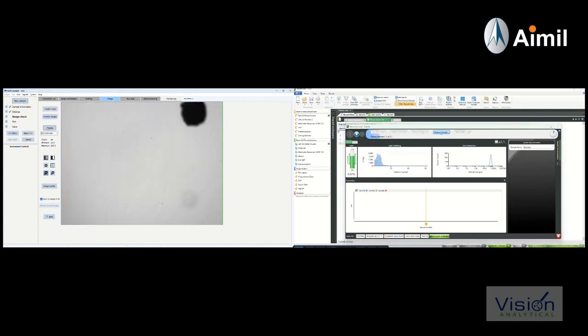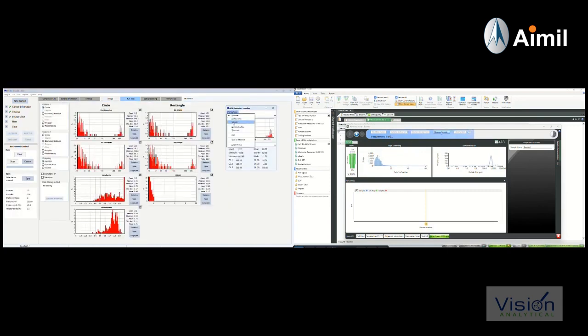And what I've noticed is there are definitely some small particles in there. If I convert this over to a volume weighted distribution, we'll start seeing some similarity between what we're seeing here at about a D50 of 556, and here we're looking at somewhere in the 500s. So that's the first measurement.